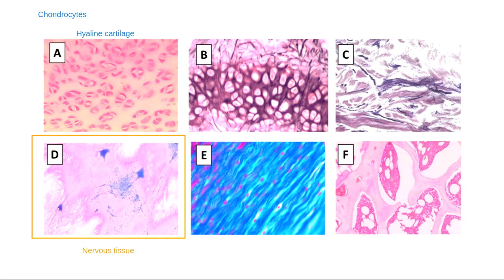Elastic proteins equal purple. So anytime we see dark purple, that means I have elastic proteins in my tissue. If I have dark purple that's next to these big, large chondrocyte cells, then I'm looking at elastic cartilage. Elastic cartilage. So if you see purple proteins by cartilage cells, by chondrocytes, that's elastic cartilage.